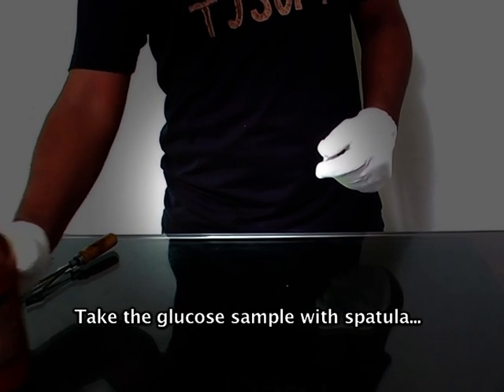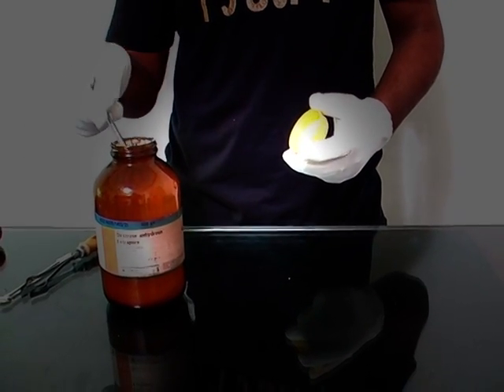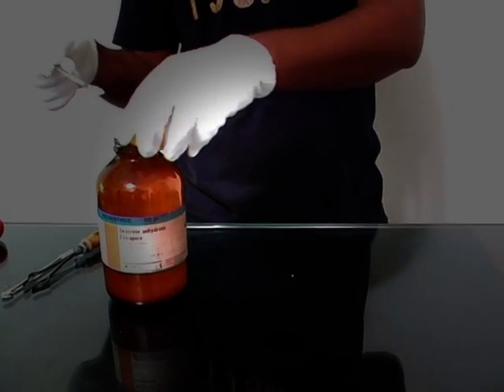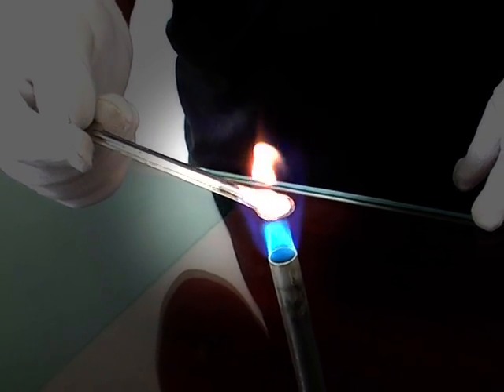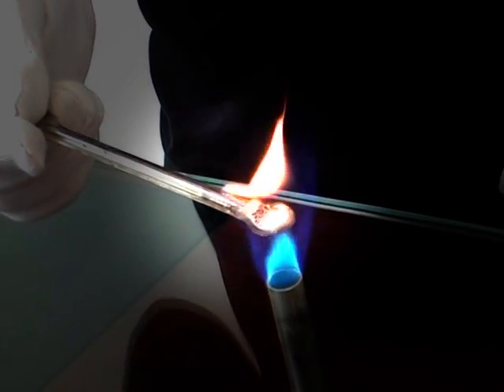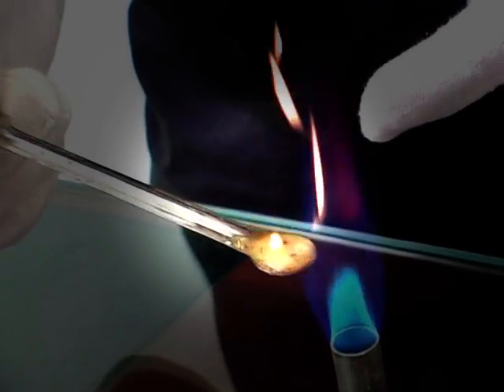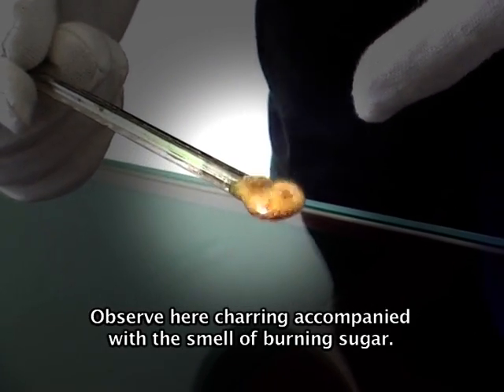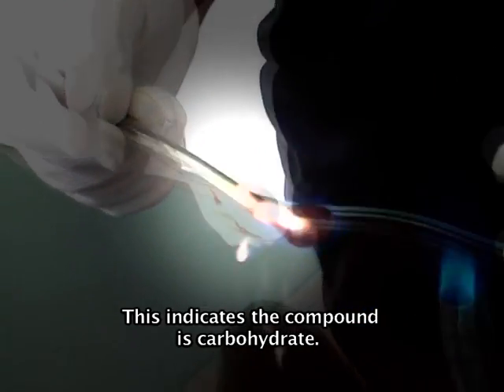Take the glucose sample with spatula and heat the spatula on the Bunsen burner. Observe here: charring accompanied with the smell of burning sugar. This indicates the compound is a carbohydrate.